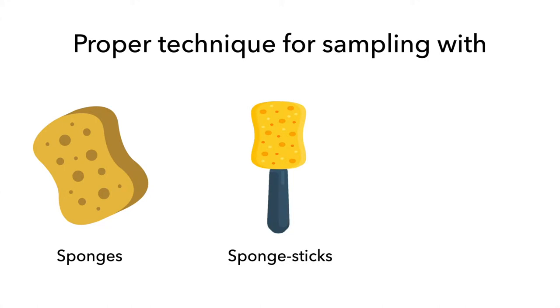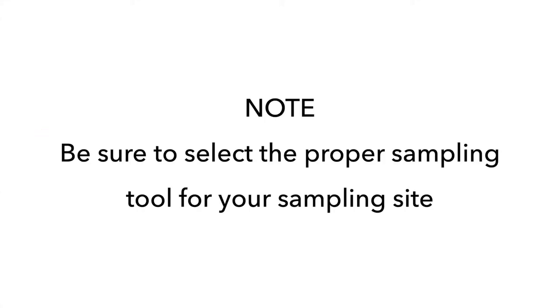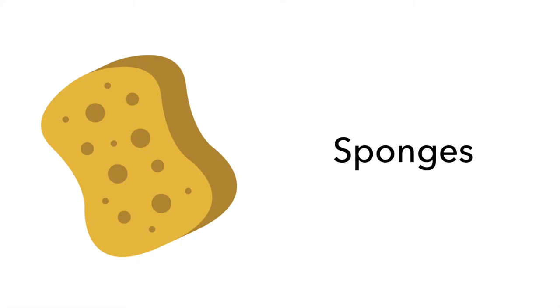We will show you the proper technique to sample with the most common swabbing tools: sponges, sponge sticks, and swabs. Note, be sure to select the proper sampling tool for your sampling site. First, we will cover the use of sponges.